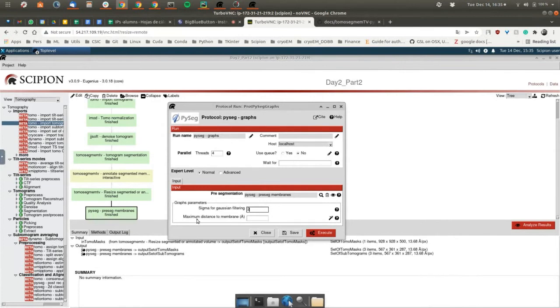It can also be a curved line due to flexibility, so you can determine a value considering this curved line length, which is smaller, for example, than how far is the edge of the outer and inner surrounding areas.